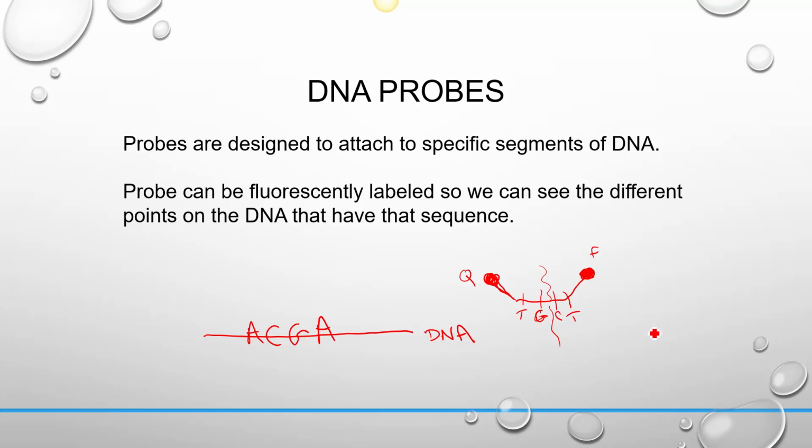And there's these molecular beacons that exist as well, that exist in like this hairpin structure. And as there's a quencher here and a fluorescence here, and as this thing binds, it gets far enough away from each other so that the quencher doesn't absorb all of the fluorescent signal. Either way, a detector will pick up the fluorescence if the sequence is present.